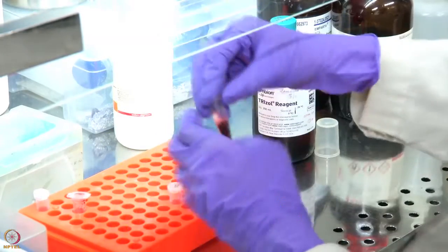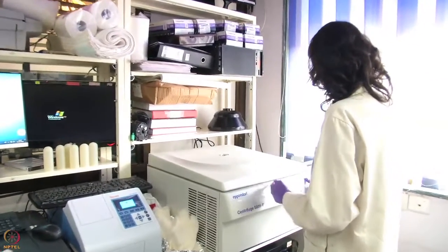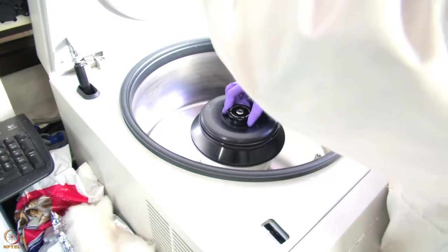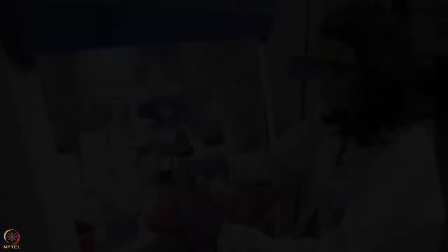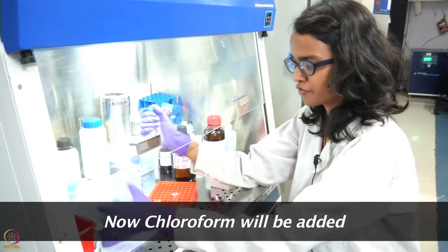This is then mixed thoroughly. After addition of Trizol, the tubes are mixed nicely and then centrifuged. We will now add chloroform to the tube.